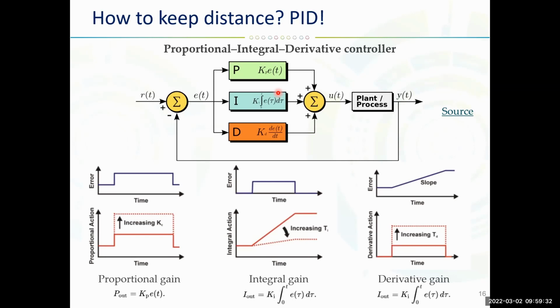Okay, so what we can see here. First of all, I would like to introduce you to some terminology. What we are looking at is a set point. Set point is the value that we want the process to be.